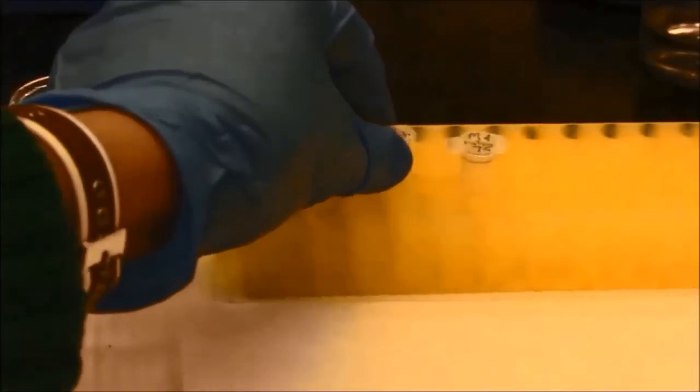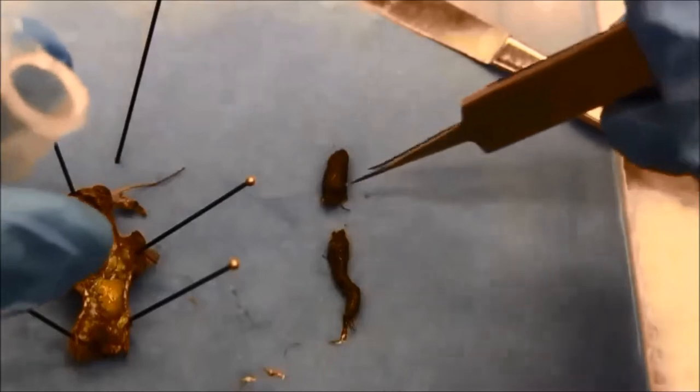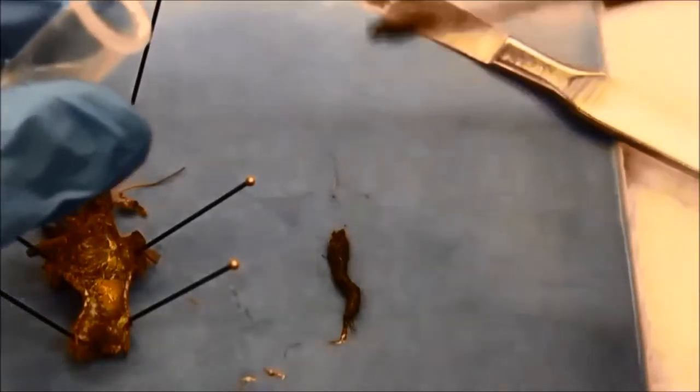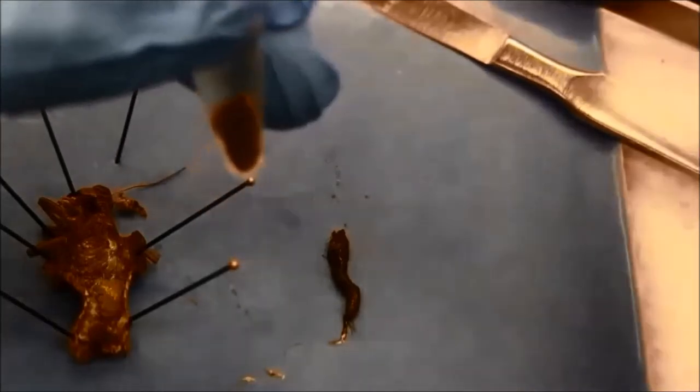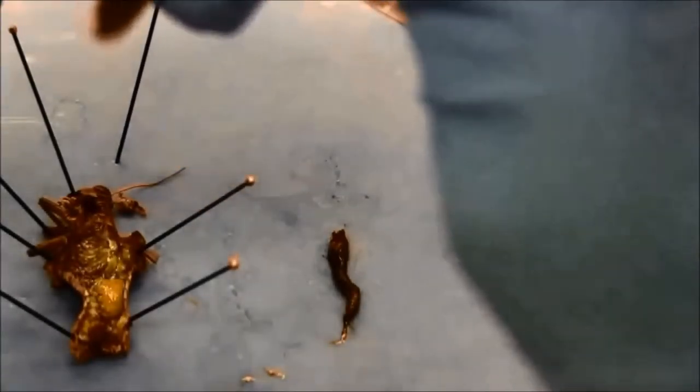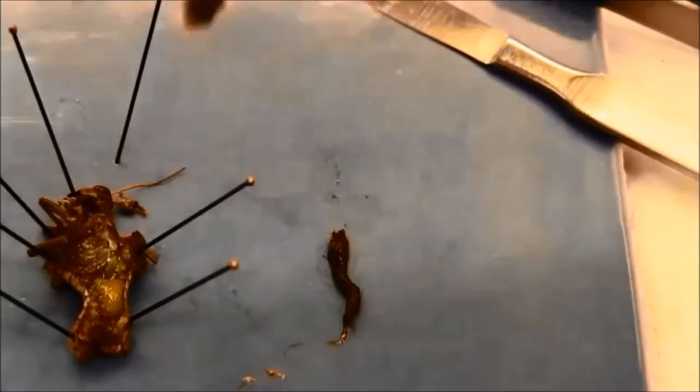Then I need to place the foregut, midgut, and hindgut parts separately into microcentrifuge tubes with 70% ethanol and store them overnight before the DNA extraction.